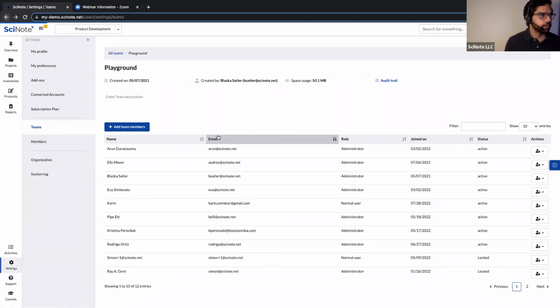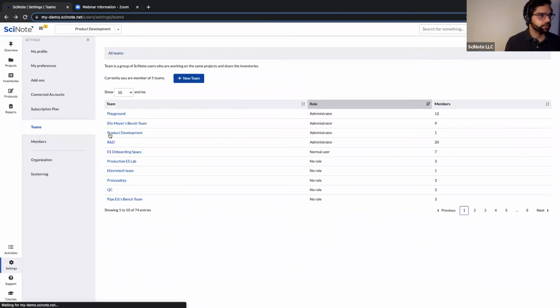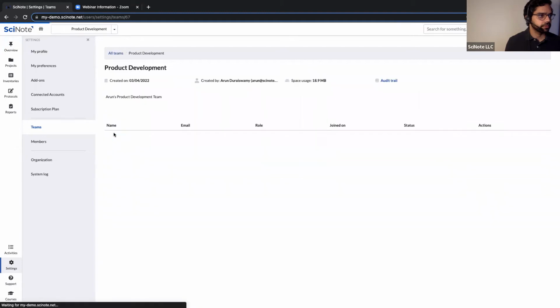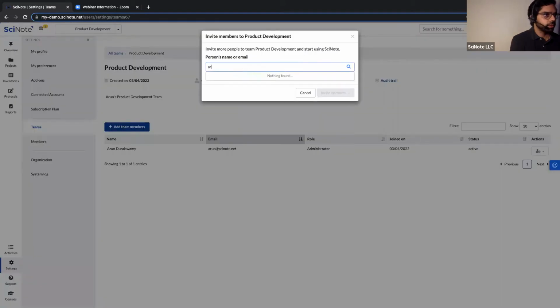Oh, sorry, wrong team. It's only me. So let me try to add one of my other accounts and grant this account access.